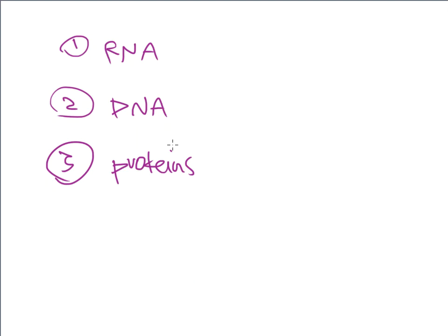All of this is really protein-based, and that chemistry is very important. These proteins, just like DNA and RNA, are very globby, really big and fat and wobbly, and we have to separate them sometimes. Traditional separation techniques might not work the best because I need a little bit of extra help. So RNA, DNA, and proteins are all very commonly run on electrophoresis.